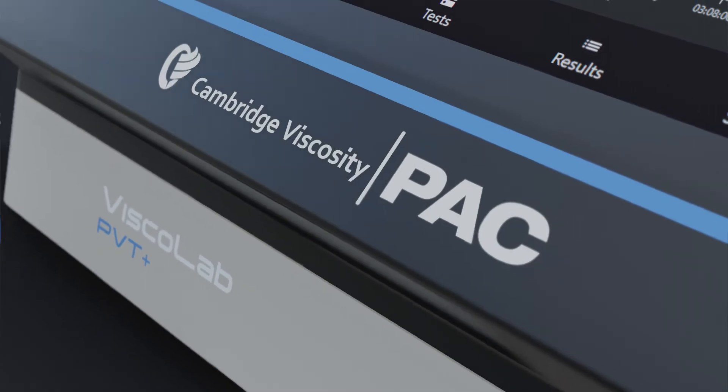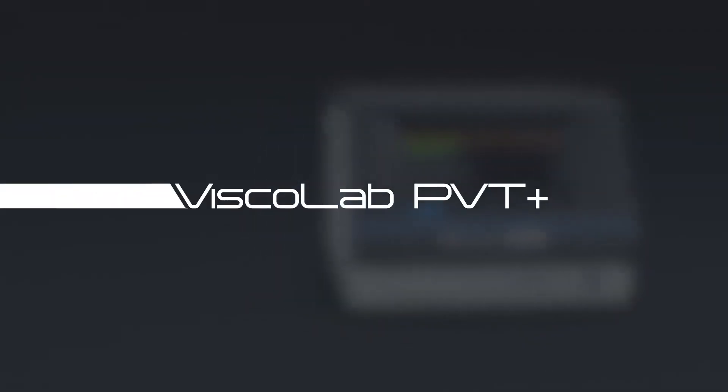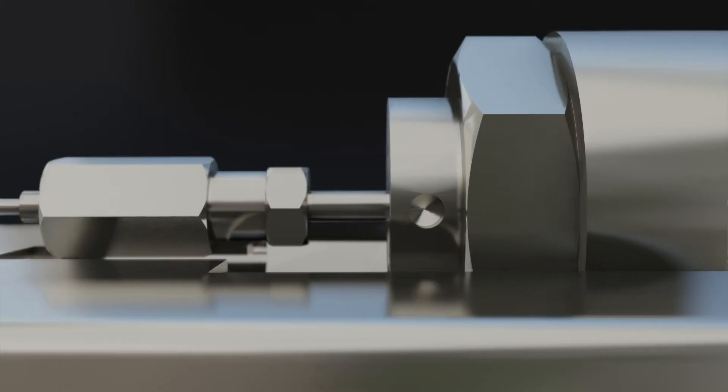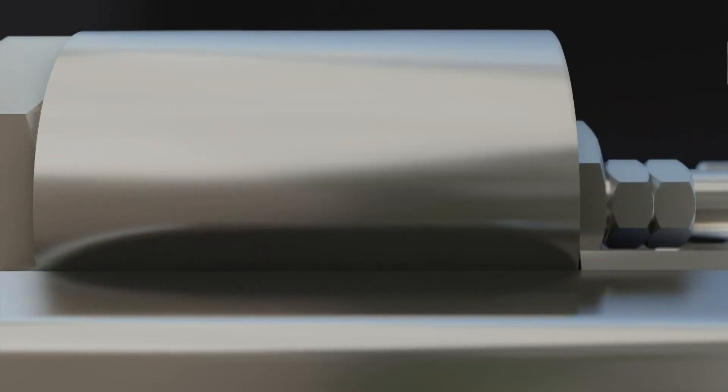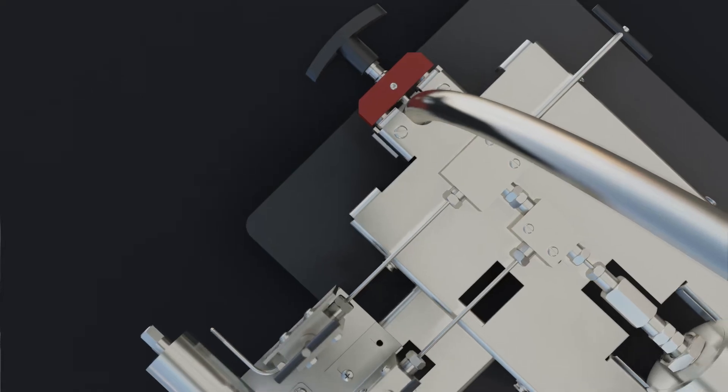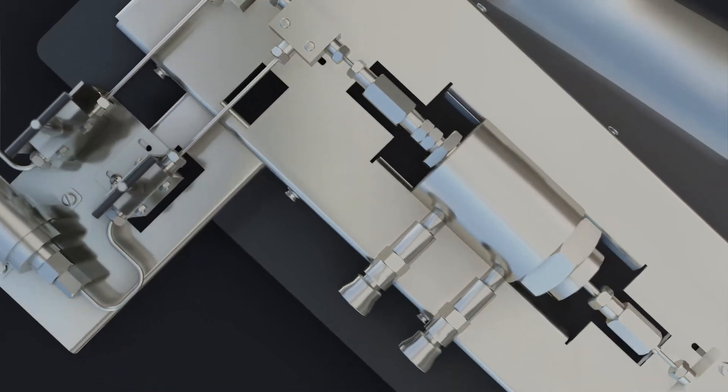This is Cambridge Viscosity's ViscoLab PVT Plus. At its core is our patented oscillating piston technology, enhanced to meet the increasing demands of PVT and R&D labs.